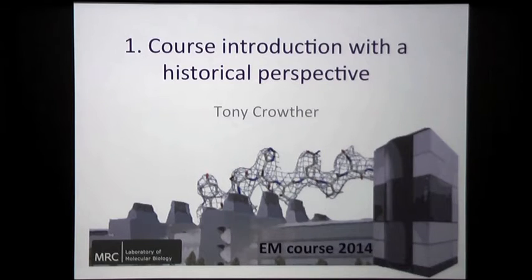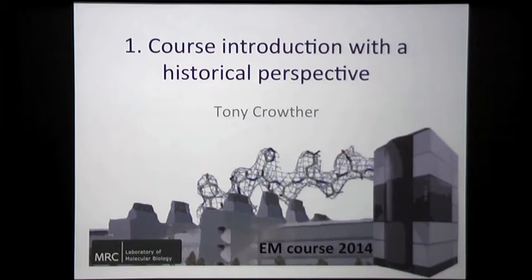So, as George said, this is indeed a very exciting time in electron microscopy. It's diagrammed here on this introductory slide that George made for all the lectures to tie them together. You're all beavering away down here doing wet things, making wonderful samples. And then we have this box downstairs on the ground floor. It's like a sort of TARDIS for Doctor Who. You put your wet sample in here and magically a protein structure comes out at almost atomic resolution.